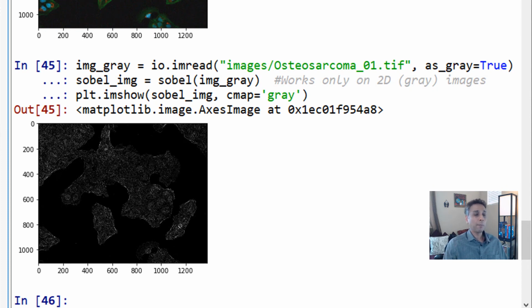Okay, so this is the power of Scikit-image. I know I haven't shown you a lot in Scikit-image, but I just want to give you a little bit of taste and cover the rest of it in the next literally 15 or 20 videos that are upcoming. But in the next tutorial, I'm going to do a similar introduction to OpenCV, and then let's go into individual applications. Thank you very much.